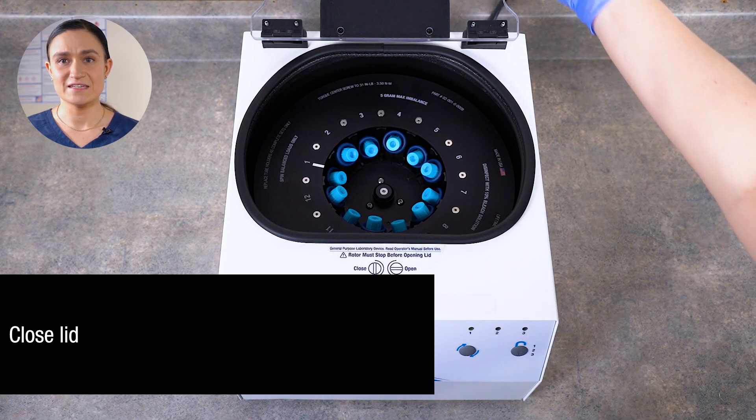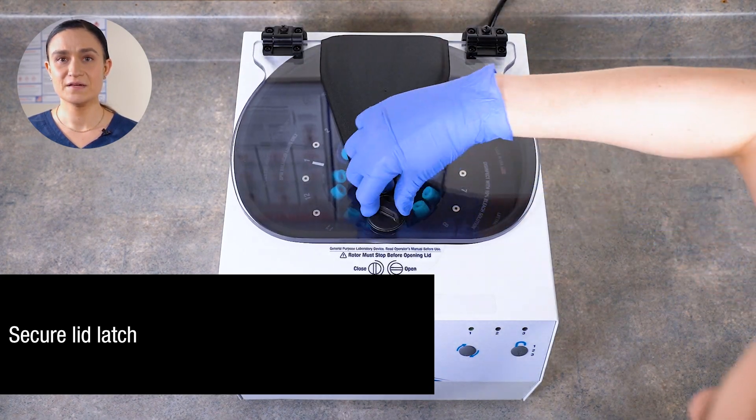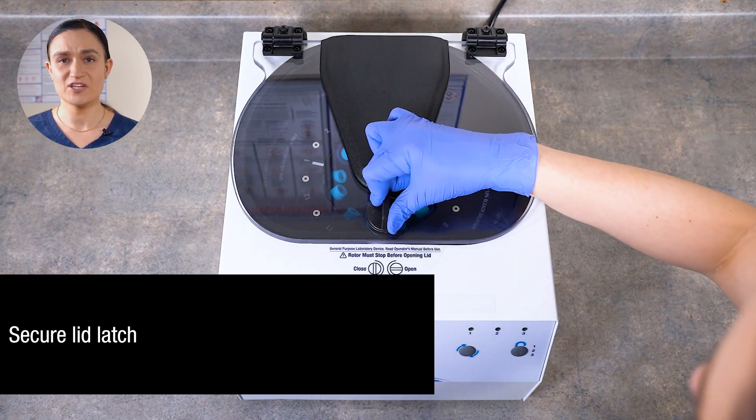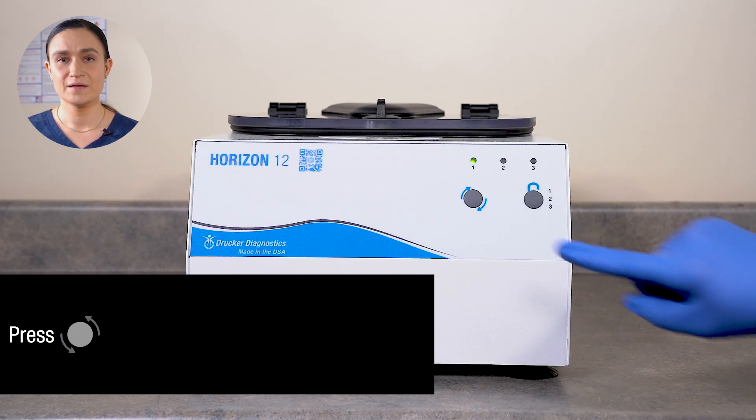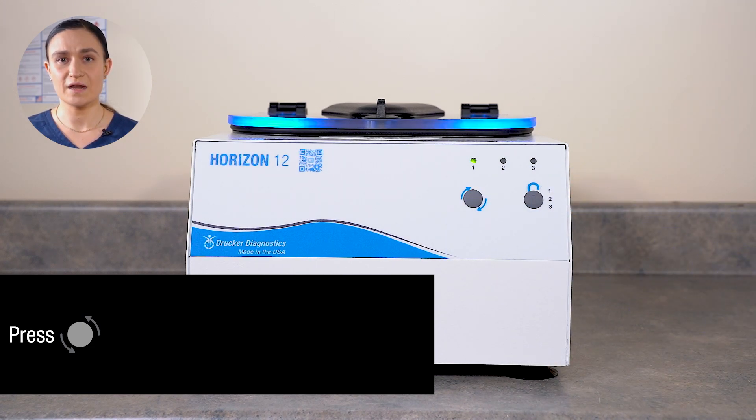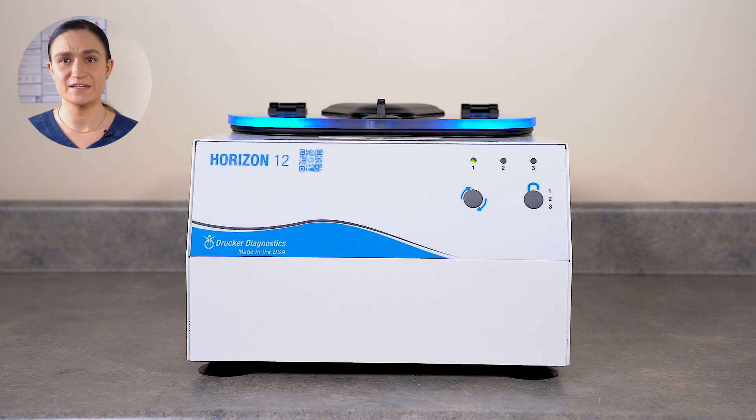With your desired cycle selected, close the lid. Secure the lid latch by pressing it down gently and turning it a quarter turn clockwise. Press the start button. The centrifuge will automatically lock and the rotor will begin to spin, accelerating until it reaches the cycle's RPM. It will then run for the cycle's programmed time.